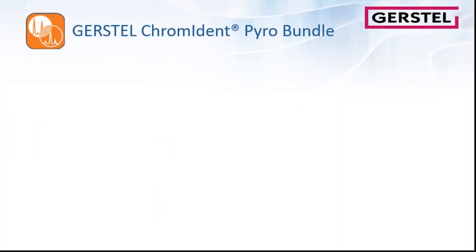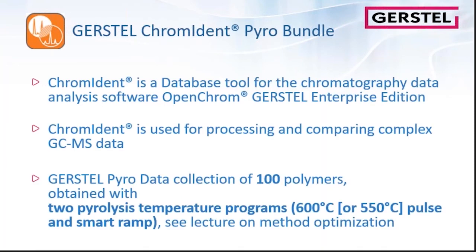The software itself, we call it ChromIdent PYRO bundle. It is a database tool for the chromatography data analysis software called OpenChrom GERSTEL Enterprise Edition. ChromIdent, this database tool, is used for processing and comparing these complex GCMS data. With the software, we have a data collection of 100 polymers that is delivered with the software. And all these data are recorded with two different approaches, the one pulse approach and the smart ramp approach. I want to refer here to the lecture on method optimization for an explanation of the difference between those two approaches. But all the pyrograms are collected here for both approaches.